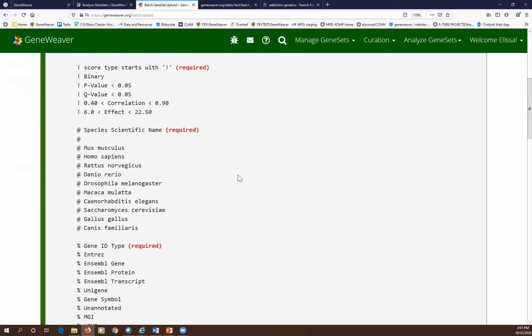The other thing is most of our tools were combinatorial. Once you go across species, the quantitative scores don't matter quite so much. There are some problems in trying to relate those quantitative scores. So we were really looking for convergence of categorical evidences. But it does make sense to bring in the weights, and we did design the tool to support the use of those weights in an integrated way. So for example, to support a proper statistical meta-analysis from the effect sizes provided. To do that, we absolutely need all the scores for all the genes.